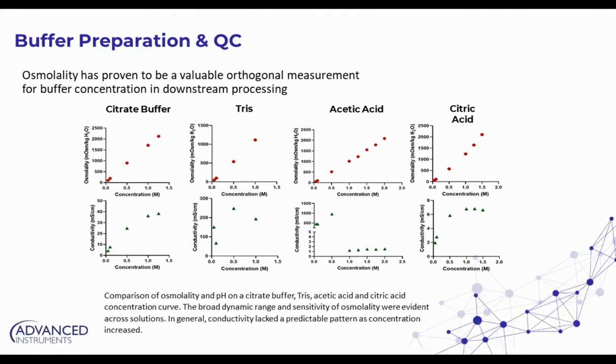If we compare that to something like conductivity, certainly we're not seeing a linear curve, but another issue is that, for example, with something that's weakly dissociating, like acetic acid here, you tend to see that at really high concentrations, there's not that resolution.